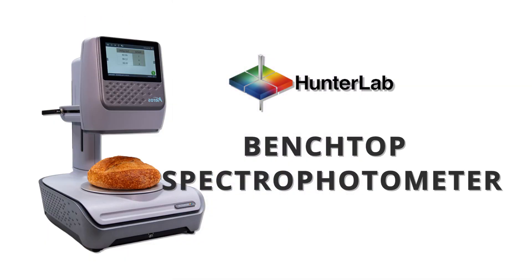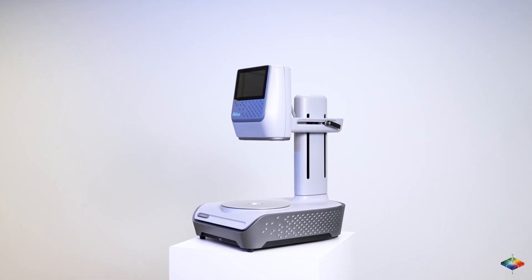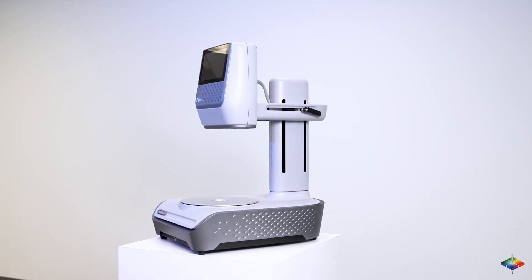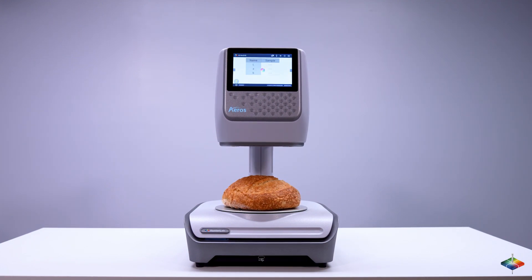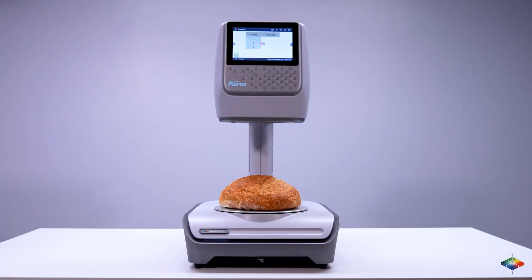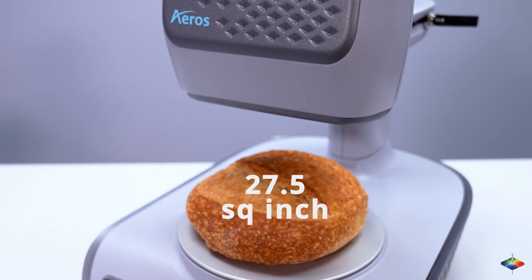Hunter Lab offers Eros, the only innovative non-contact benchtop spectrophotometer worldwide. Auto-height positioning enables color measurement with better accuracy and safety, simplifying sample presentation and clean-up time. With Hunter Lab Eros, simply place the sample and hit measure. Samples automatically rotate beneath the smart sensor — 5 seconds, 35 measurements, 27.5 square inches of sample.